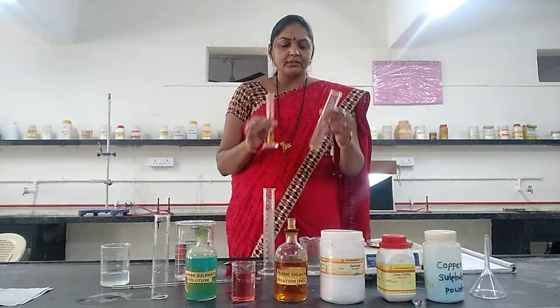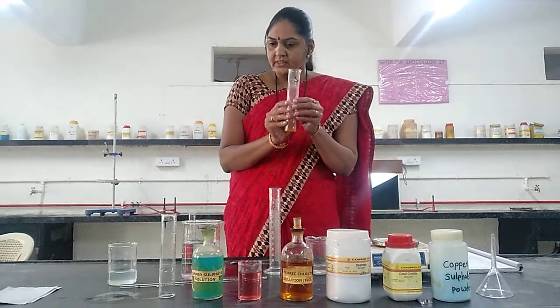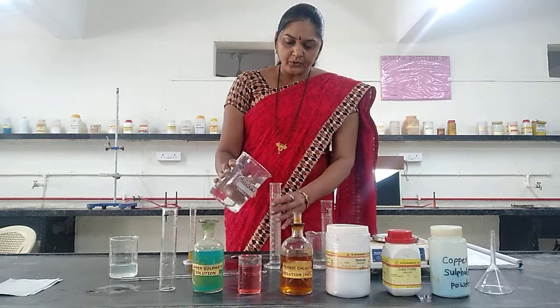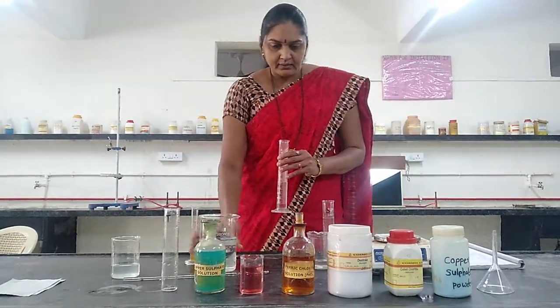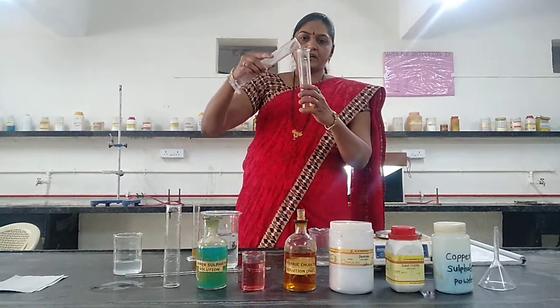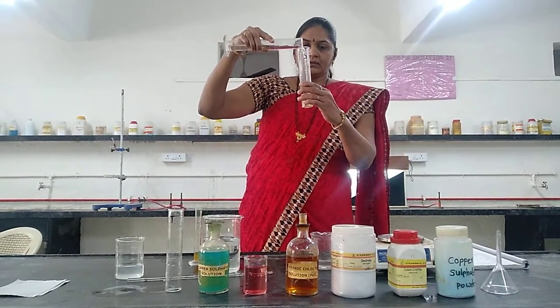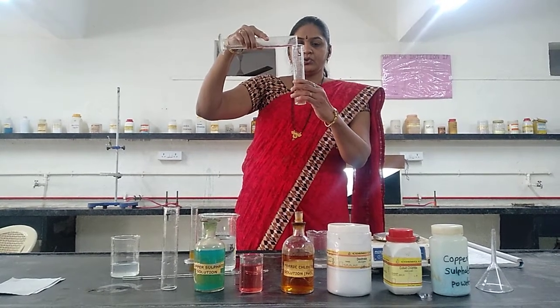and then the standard solution is taken in the standard Nessler cylinder, and the volume is made up with distilled water up to the mark, that is up to 50 ml. Up to this mark we have to take. This is the preparation of standard solution.